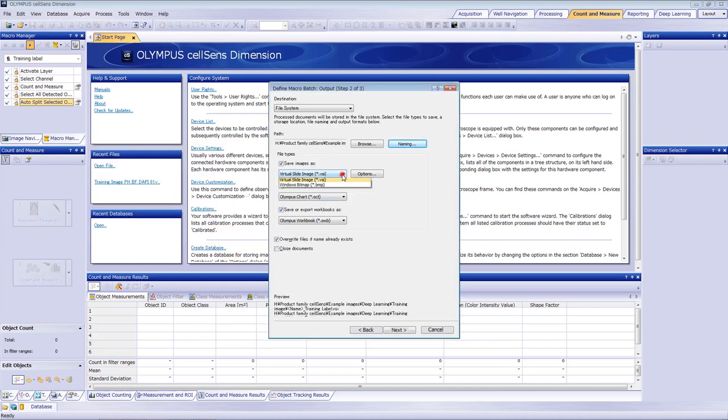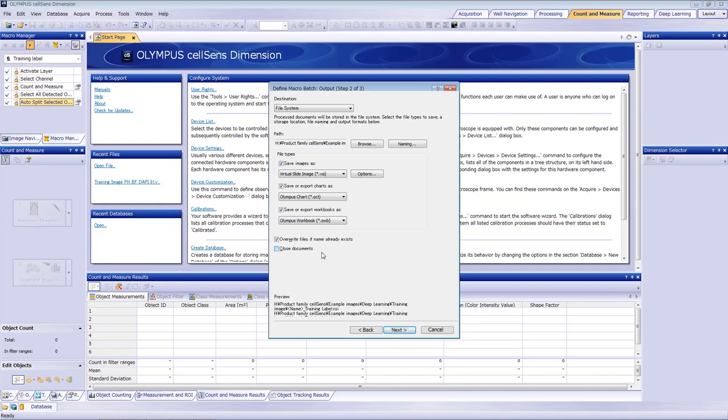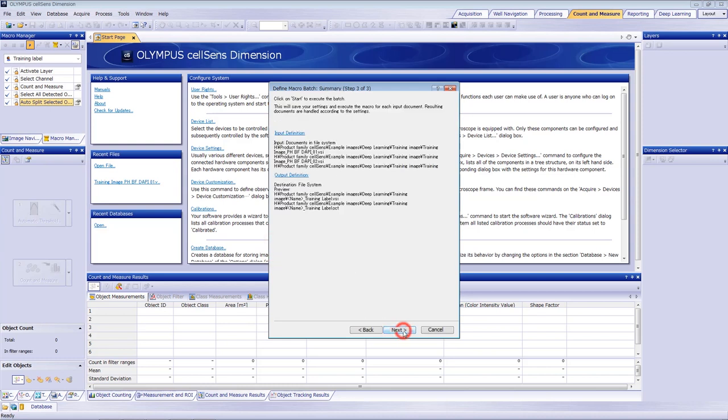The training data must be in VSI format. Normally, we recommend you select Close Documents in case the batch macro is applied to a large number of images. Since we are only using 10 images in this example, we'll leave it unselected.